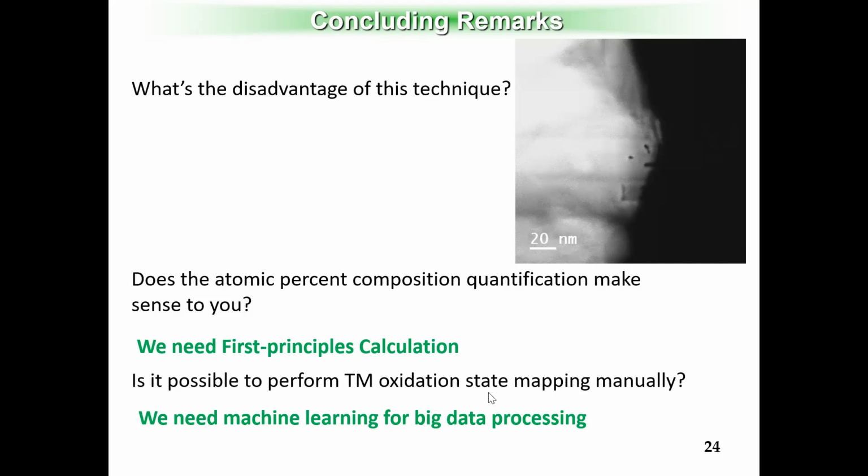Another thing is that a lot of people criticize TEM, saying you only have local information, right? Because you only focus on one particle, one very high resolution region. But if you want, we can actually enable statistics for TEM. And the methodology is that in a lot of microscopes, there is now automated collection of the data. So you can move the beam from one location to another location and so on, and collect a lot of images from many different locations. But that way, you will generate a lot of data, right, in terabyte or gigabyte size.